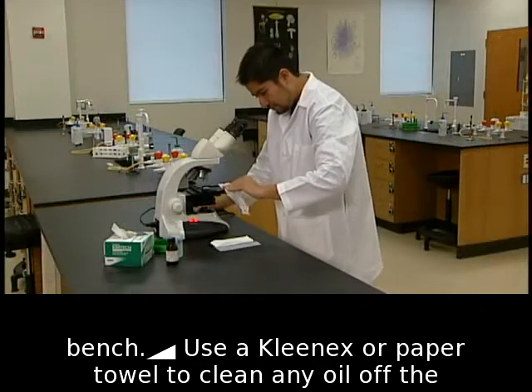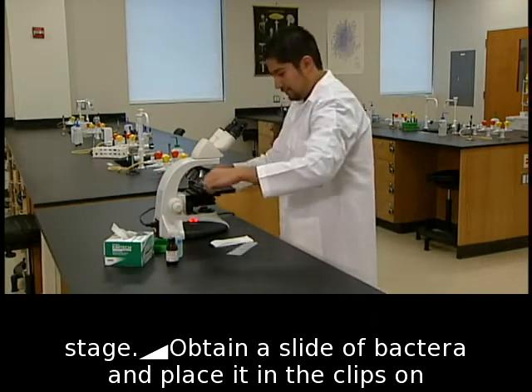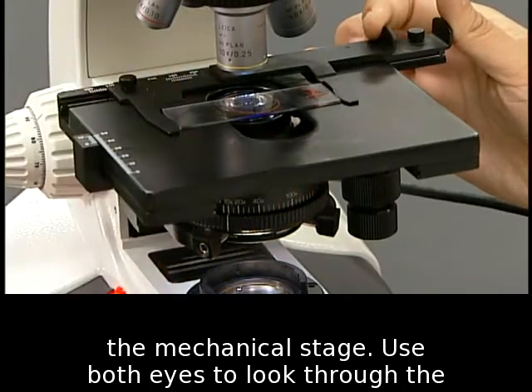Use a Kleenex or paper towel to clean any oil off the stage. Obtain a slide of bacteria and place it in the clips on the mechanical stage.